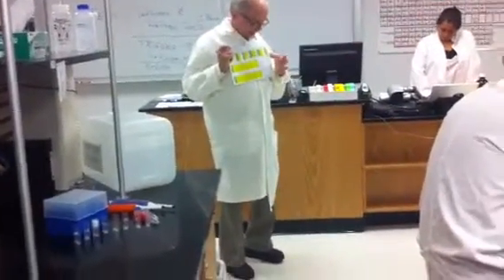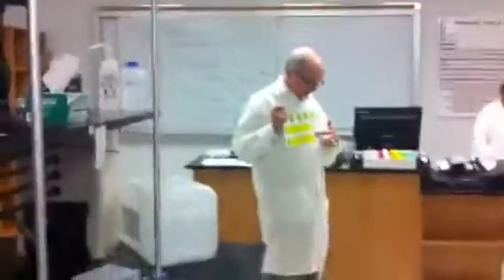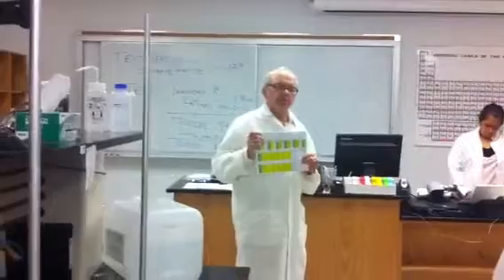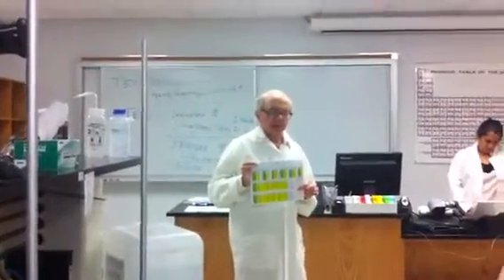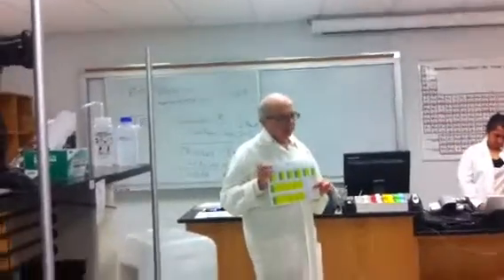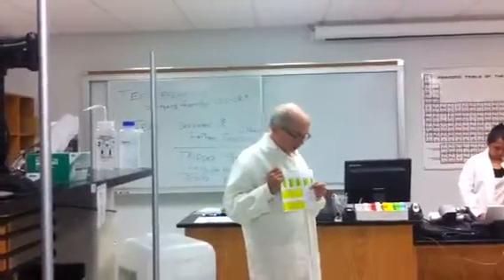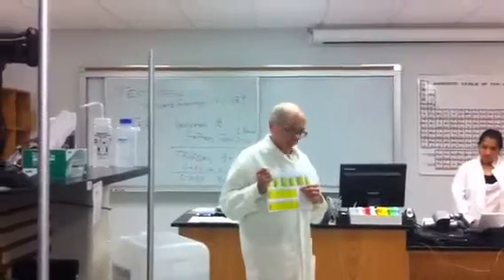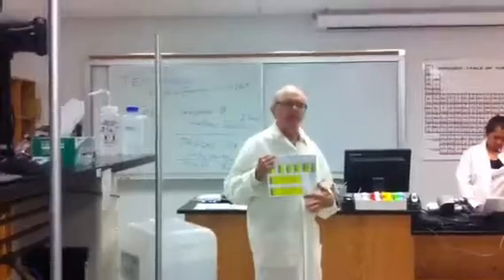Why? Because these 3 sets of data will give you a Lineweaver-Burk plot. So in other words, it is sitting there waiting for you to create. So you create graphs. Again, you go to insert graph, scatter, blah, blah, blah, and it says what's your X range, what's your Y range, and you give them that data right there.